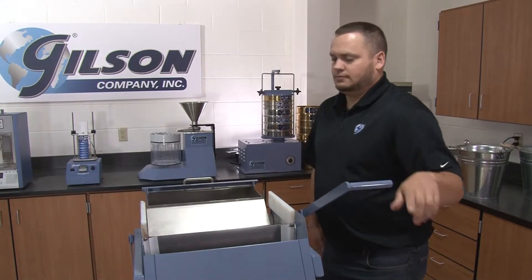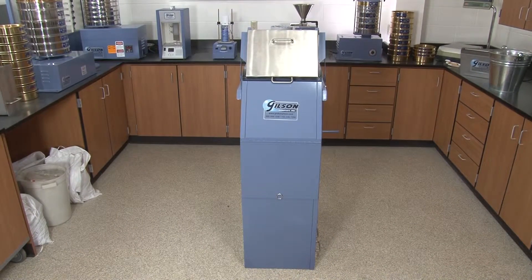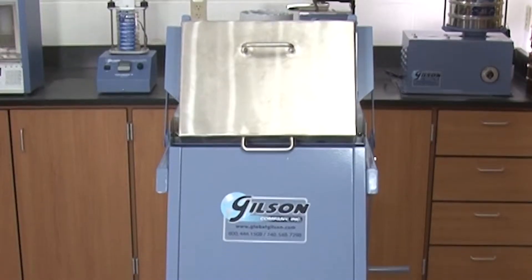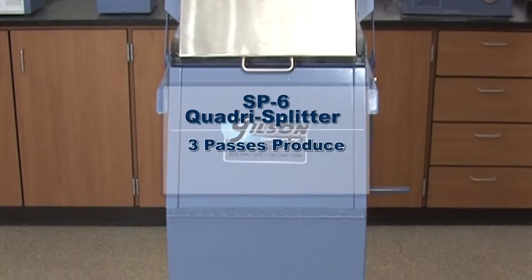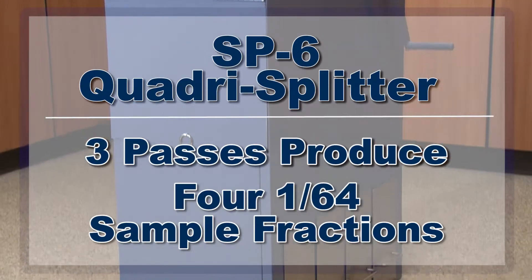To obtain smaller specimens, pans containing a quarter split can be divided through the Quadra Splitter multiple times. Three passes through the splitter will produce four one sixty-fourth sample fractions.